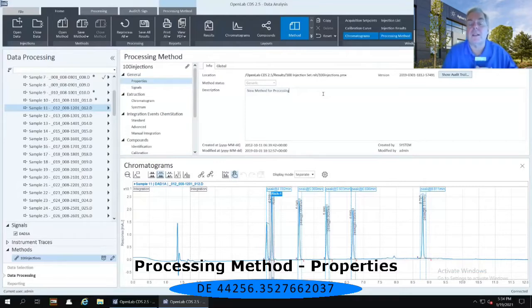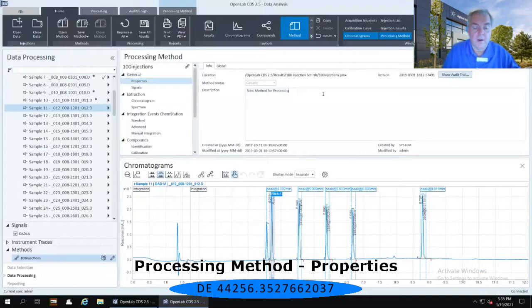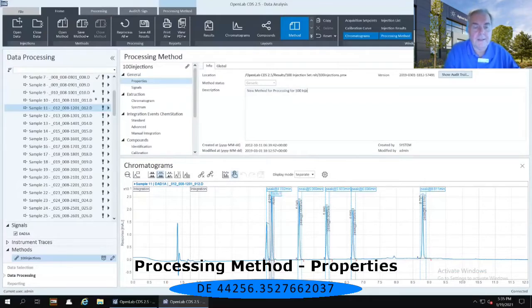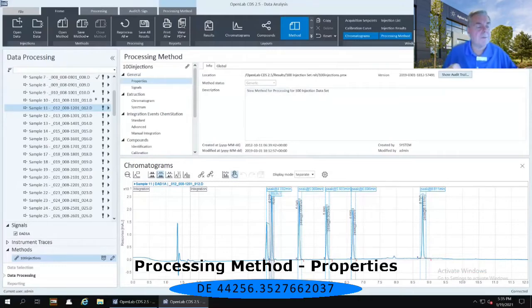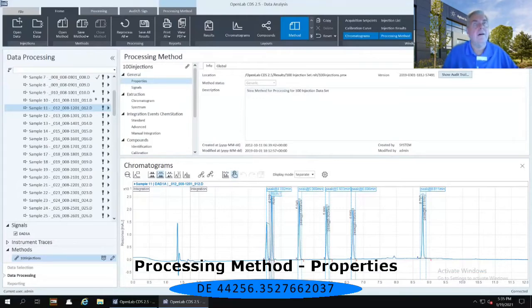So currently, what's in there is new method for processing, or I'm going to just add for 100 injection data set. Now you don't have to add anything here, I'm just showing you that this is where you can put in some specific information about the processing method itself.